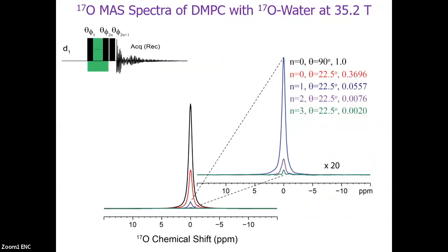And so we first measure the signal to verify the suppression, how well it compares to the theory. As shown here, when we set n to 0, 90, 22, instead of using 30 degrees, we use 22.5, which adds additional suppression but also decreases the bound water signal slightly.